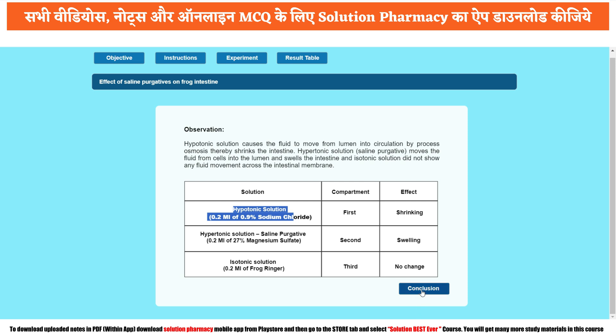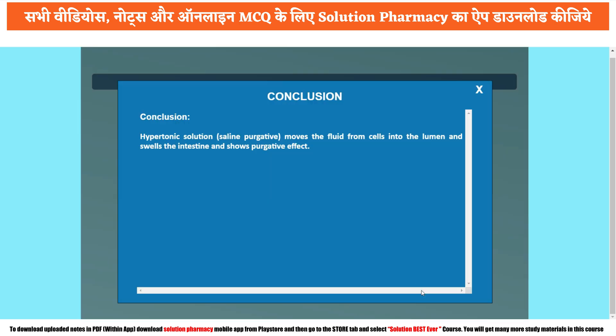Click on the conclusion tab. The conclusion reads: hypertonic solution, or saline purgative, or osmotic purgative, moves the fluid from the cell into the lumen, swells the intestine, and produces a purgative effect. This was today's experiment with the help of xform software. I hope you got the concept of the experiment. Thank you so much for watching this video. Namaskar, take care.